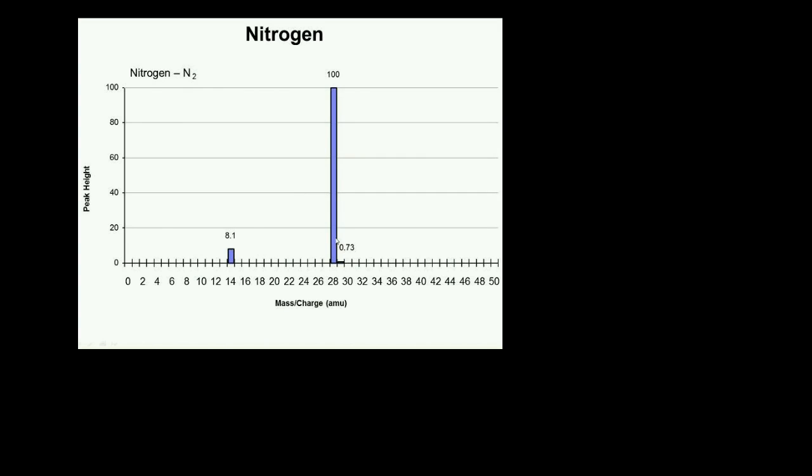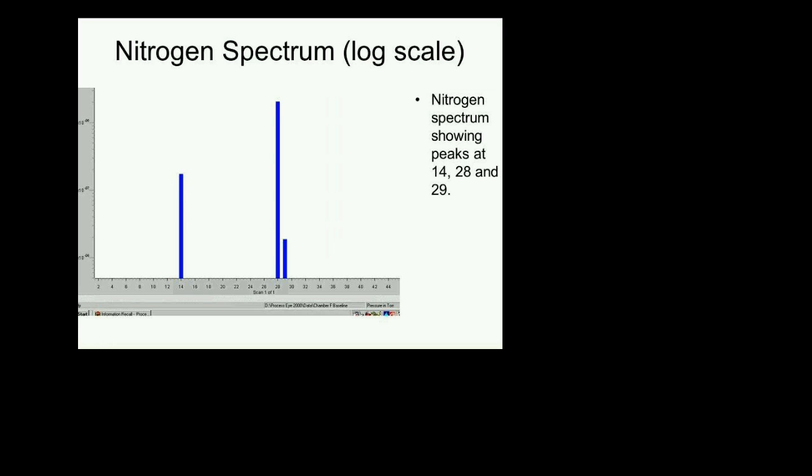Remember, there is also carbon monoxide coming out of the filaments in an RGA. So sometimes the question arises, well, I'm seeing 28. Is it carbon monoxide from the filament, or is it nitrogen coming in? Well, look at the peak at 14 AMU. If the peak at 14 AMU is 1/10 of the peak at 28, it's nitrogen. If the peak at 14 AMU is not there, obviously it's not. You must look for 12 and 16, and that must be carbon monoxide. So you very quickly diagnose your system.